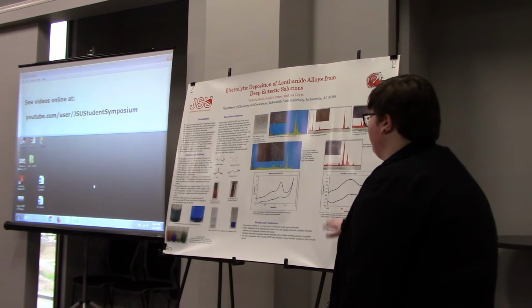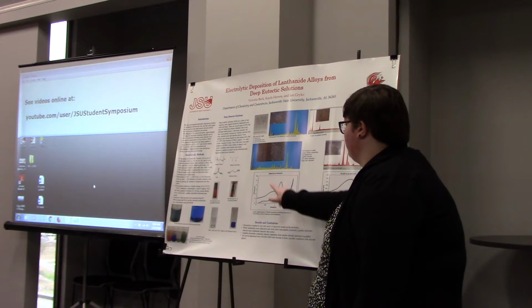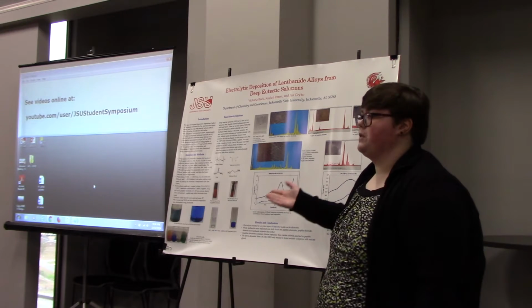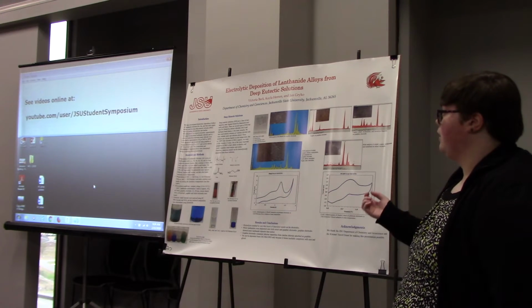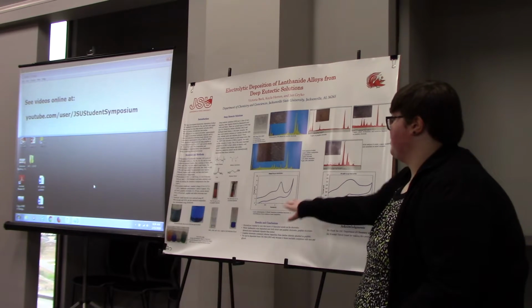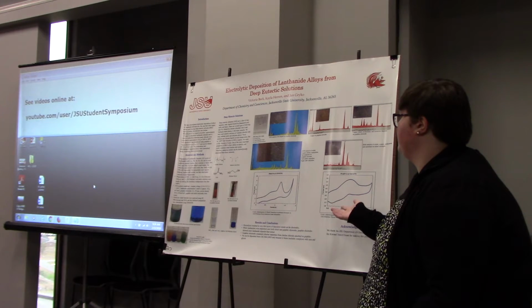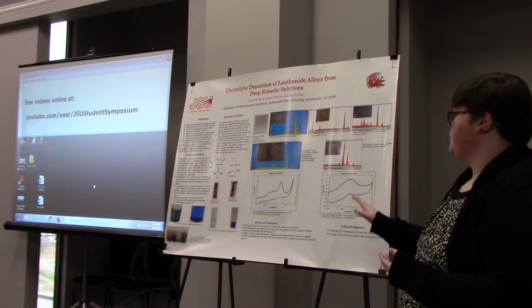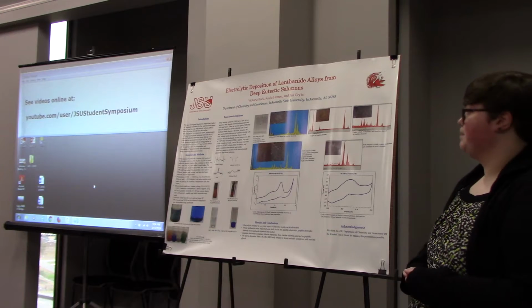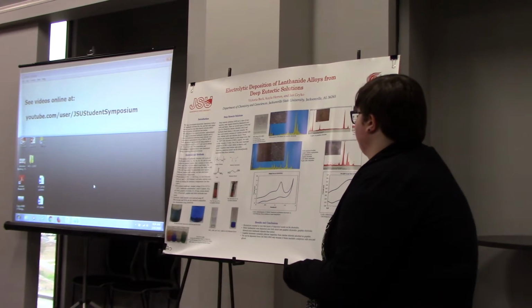So these are cyclic voltammograms. Basically what these tell us is at what potential samarium or cobalt is reduced, which is important for us because we need to know what voltage to set our electrolysis at, because this is actually not really well documented in these solutions. And these are both dissolved in choline chloride and ethylene glycol, and this was run with platinum electrodes at room temperature.